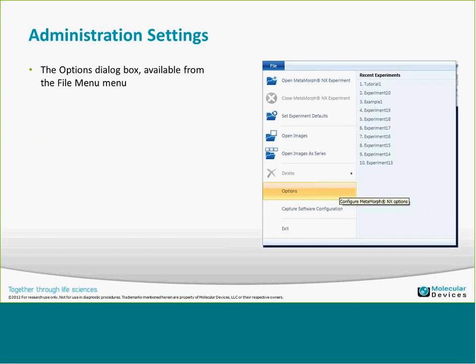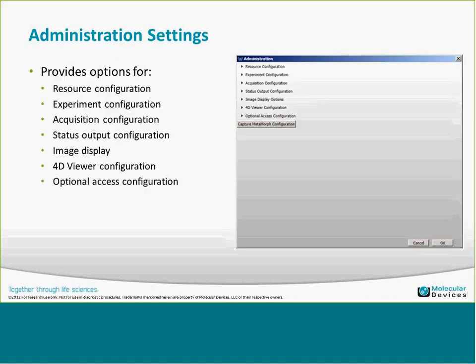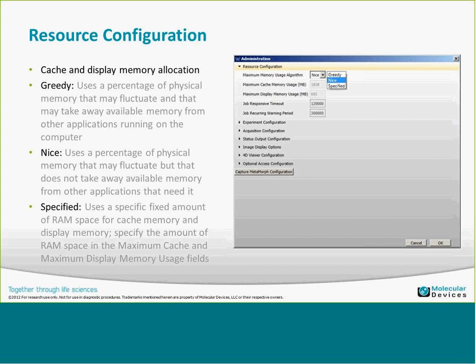The administration settings are the options dialog, available from the File menu by selecting Options, which brings up the administration settings dialog. The first is resource configuration, where you have three options: greedy, nice, or specified.